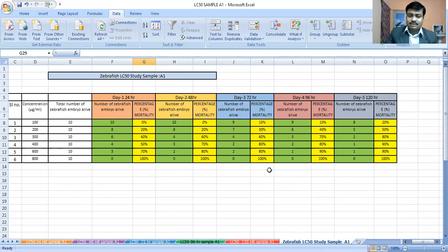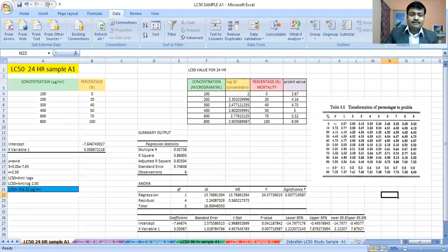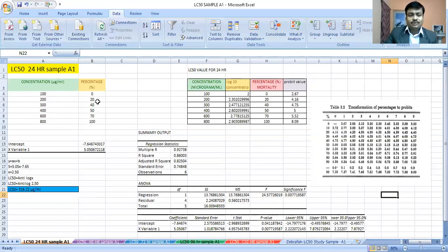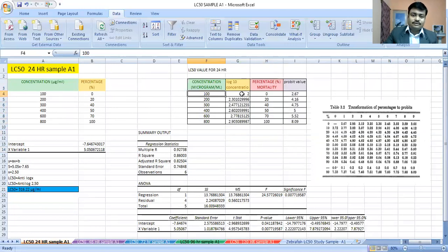Now I will show you how to statistically calculate the exact LC50 value. Considering the sample after 24 hours, the concentrations are 100, 200, 300, 400, 600, and 800 micrograms per ml, with percentage mortalities of 0%, 20%, 40%, 50%, 70%, and 100%. You must create a table with these concentrations, then convert each concentration into log concentration using Excel — for example, 100 to 800 converts to log values of 2.00, 2.30, 2.47, 2.60, 2.77, and 2.90.